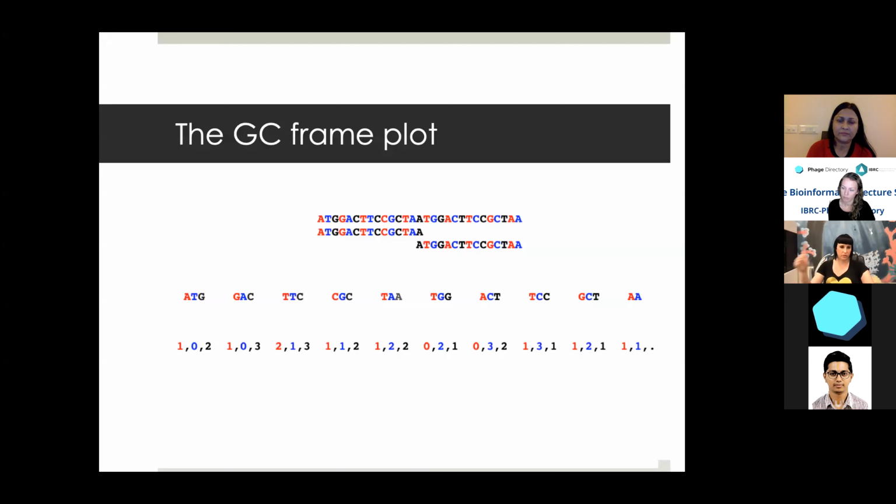For the low GC content genomes, it's the opposite, they pack their T's and A's in that last third frame. So the highest GC is in the first or second frame. And so that's the only way it changes, but I don't believe it changes across gene classes. Although it could, because certain gene classes have different amino acid frequencies, but I'm not really sure how much it changes.